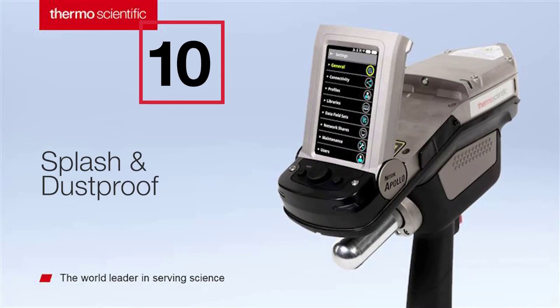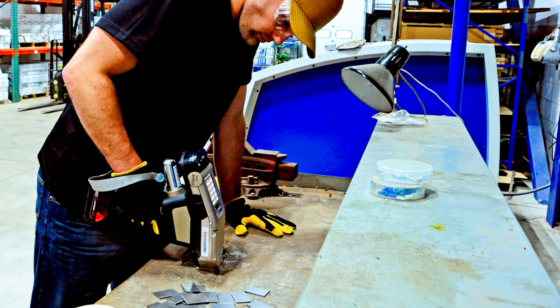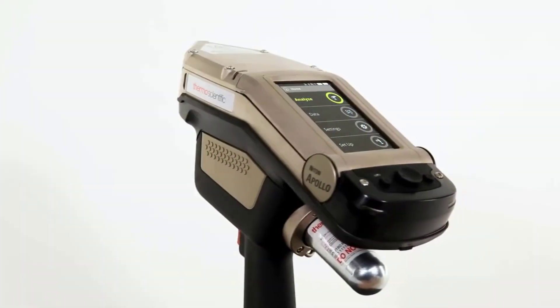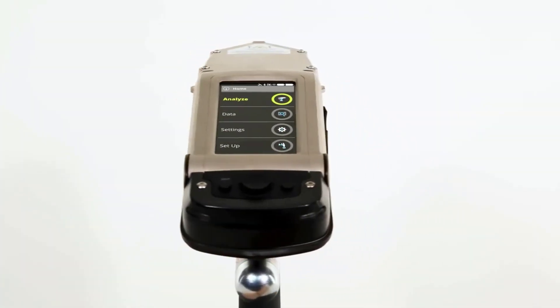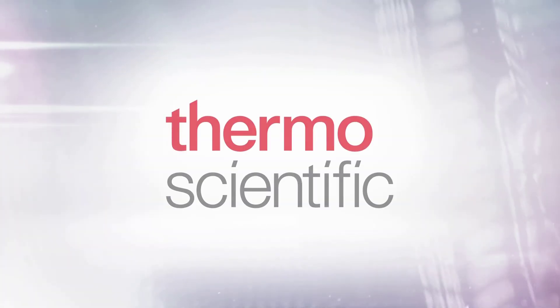Whether the conditions are wet or dry, hot, cold, or dusty, the Niton Apollo will adapt to your environment. Become a leader in your industry with the Thermo Scientific Niton Apollo LIBS Handheld Analyzer — a tool designed with you in mind.